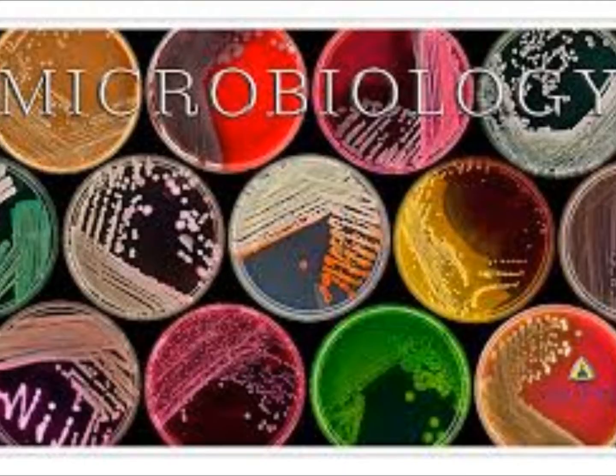So when you see an organism that's growing on the blood plate and the CNA plate and not the MAC, and it's yellow, one of the first things you're going to think of is, oh, maybe it's Micrococcus luteus. Now, that doesn't mean that's what it is, but a lot of times when it's a bright lemony yellow, that's just what a microbiologist is going to think. There are other organisms that do that, but that's one of the more common ones.